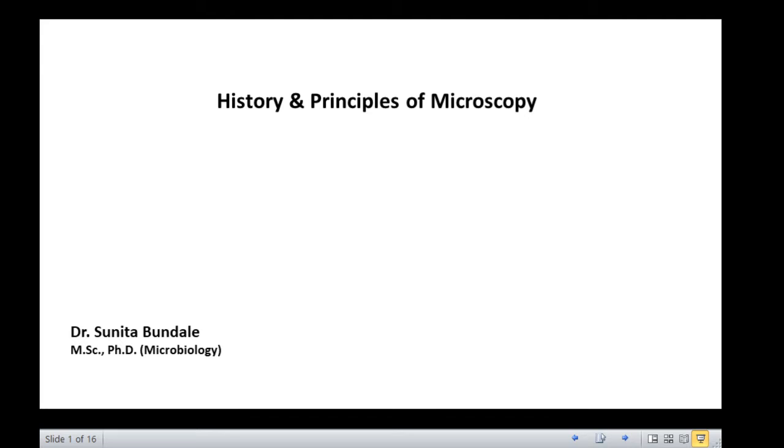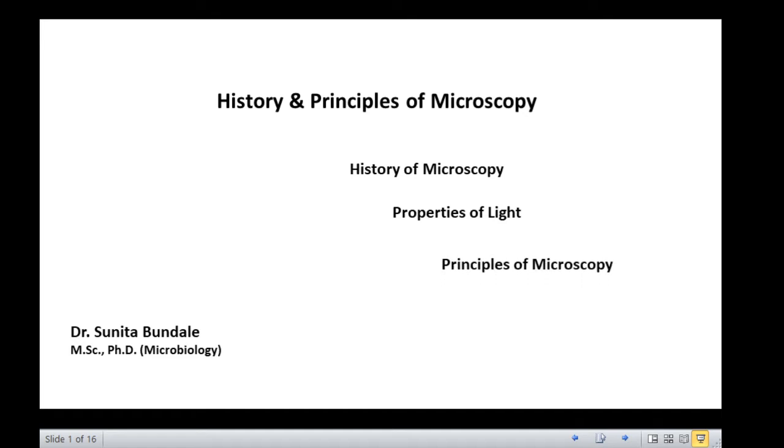Hello friends, in this lecture we will discuss the history and principles of microscopy. We will start with the history of microscopy, followed by properties of light. We will then move on to the general principles of microscopy like resolution, magnification, angular aperture, numerical aperture and working distance.